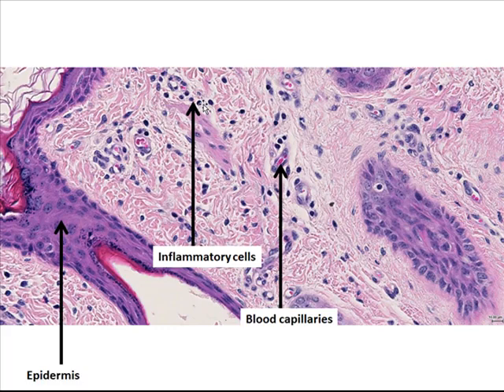Normally in the dermis, I mentioned before, the skin is an immunologically active site, so it's got cells in it ready to respond if there's pathogens that need to be dealt with. But in the normal skin there shouldn't be this number of these nuclei dotted around. These are nuclei of lymphocytes and other types of inflammatory cells that are around in this area because this animal has an inflamed skin. So that's just a little bit of some extra resources and an extra idea about what other sorts of things we can see in the skin.